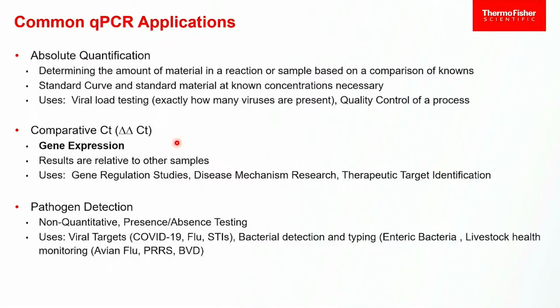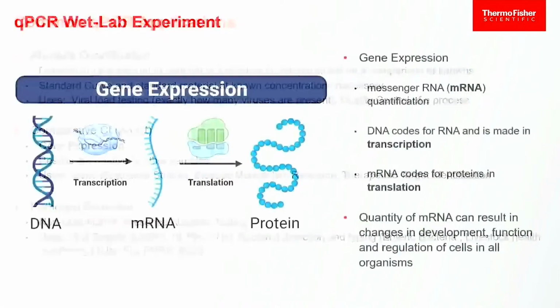Yes and no, and we're coming up to that. But I'll answer the question, and then we'll revisit it when it comes up on slides. RT does stand for reverse transcription. So RT-qPCR takes the reverse transcription step and the qPCR step and does them together. So it's two actions at the same time. So that's the nomenclature difference. We'll talk about what reverse transcription is in just a second.